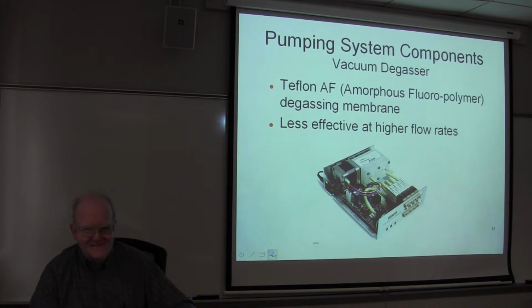Oh, so they used helium to get the gases out of the mobile phase, so then they had helium still in the mobile phase? Yes, but helium has an extremely low solubility. So there just wasn't much of it, so it didn't bother anything. If you were to use argon, argon has a solubility on the order of oxygen and nitrogen, if not higher. So it's not the inertness of the gas. You could use hydrogen if you wanted to, if you didn't mind filling your room up with hydrogen.